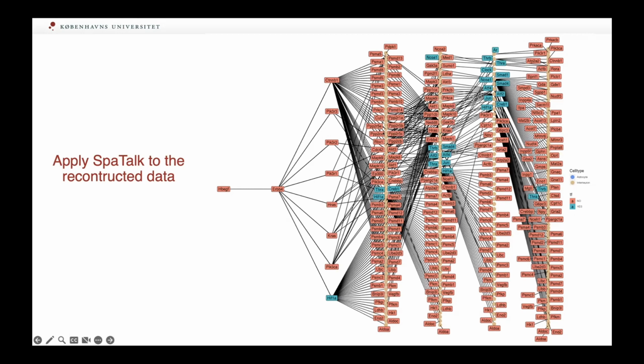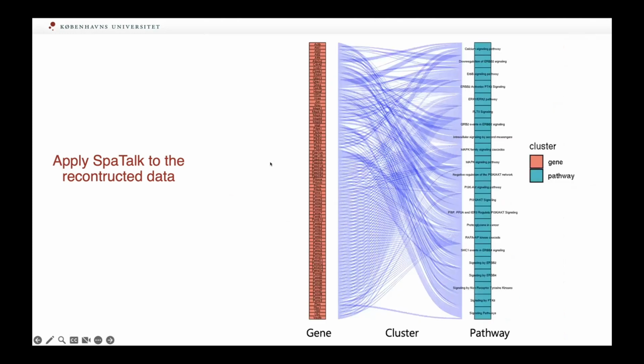With these genes, we can look into how the communication influences the functions of cells further. And we can also do some pathway analysis by running enrichment analysis for the genes that are influenced by the communication. We can know which pathways are influenced by this communication in this figure.